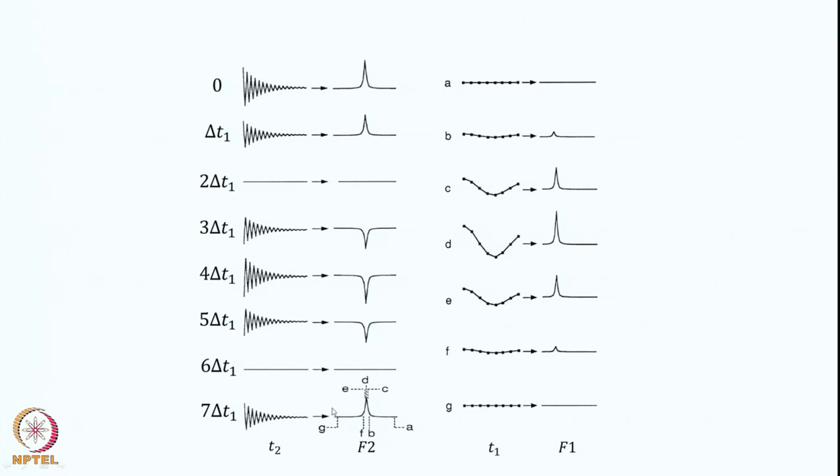Okay. Now, let us look at this in more detail. This is the spectrum here. Now, what you do, this is all also digital, right? So, when you do a Fourier transformation, you get a digital spectrum. The spectrum is drawn as a continuous analog signal, but actually appears as a digital spectrum. Each point here, there are points 1, 2, 3, 4, 5, things like that, various points are there. Now, we will pick up a few of those points here.